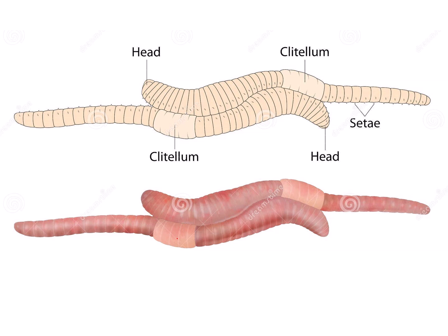It is released from these tubercula pubertatus, the swellings at the ventral side of the clitellum, and they secrete mucus. These mucus sheets keep them bound together, and the ventral sides of the worms are attached to each other.